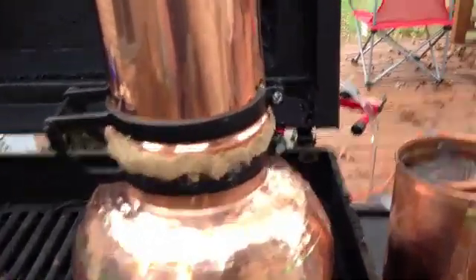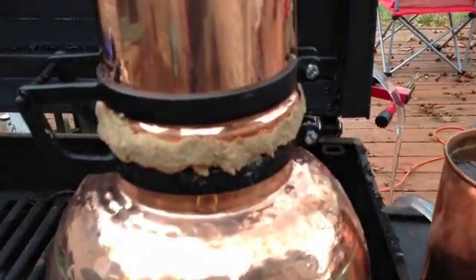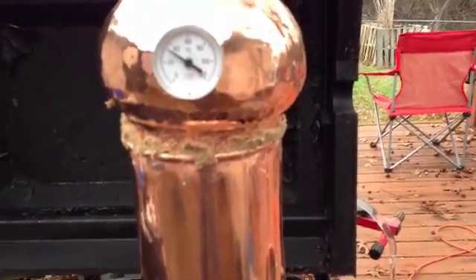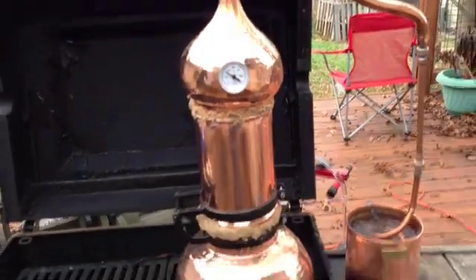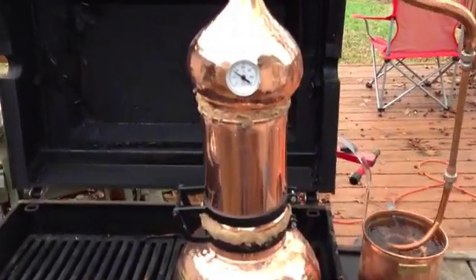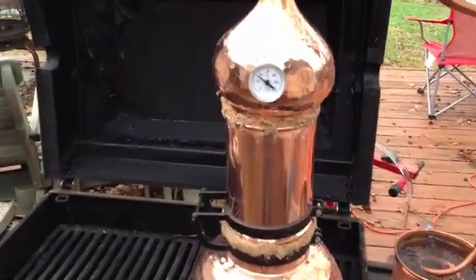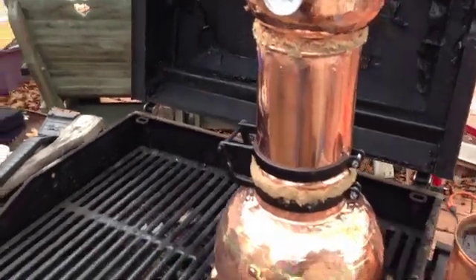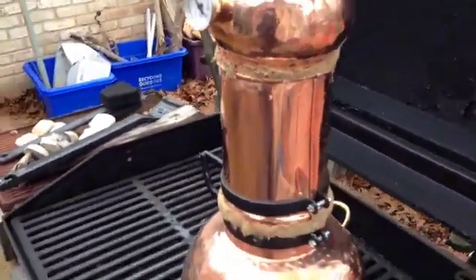You can kind of see at the seals — there and there — I have to seal those joints with rye flour paste. That's just to give it the seal that's needed. It's kind of a traditional way of doing it, so I've read.